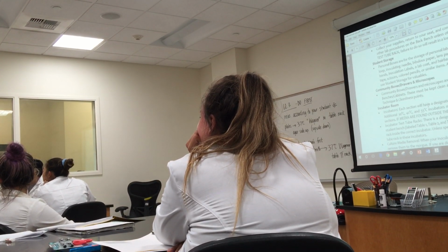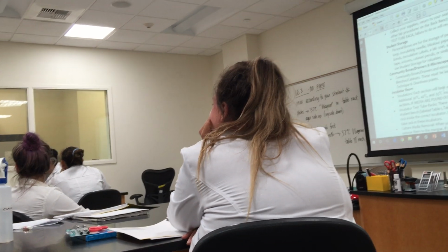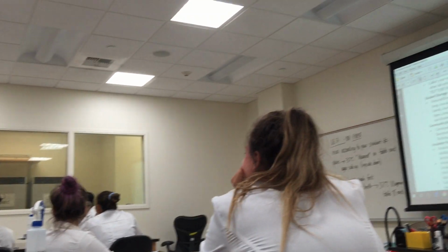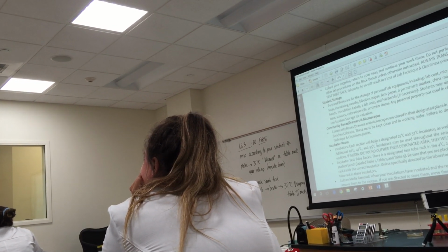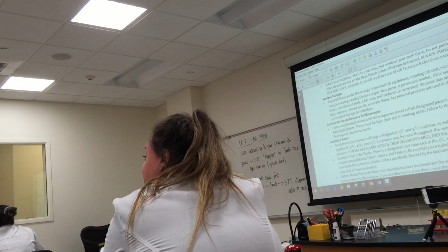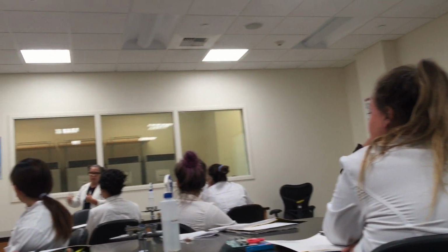Right? In the incubator room, we have goggles. We have a shared group of goggles, so you don't have to have your own goggles. You can have your own goggles if you choose to, but if you use ours, they are sterilized when you get done using them, and I always sterilize them when I get here, right? Just in case the other instructor forgets, I turn it on and sterilize it before I come in.